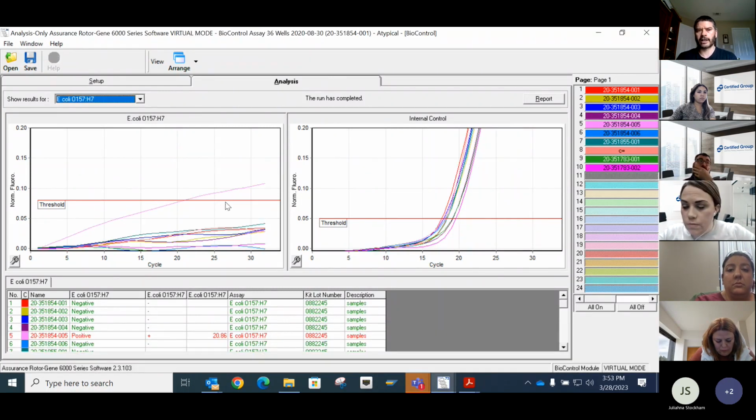But like I said, this right here is never a valid positive. You can just compare it to the IC in the run, which is obviously DNA amplification that mimics our very typical positives. Look at this. This is a great run. The ICs are showing no inhibition whatsoever. The other lines are essentially flat, but this one you can see started floating at about 2.5 cycles, and then it didn't cross until 20 cycles. That's not normal at all. That is an invalid result, and that needs to be reanalyzed.